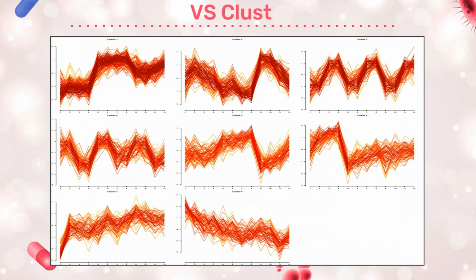So our next steps require looking at the heat maps for each of these cluster plots and seeing if it really reflects true significance that's also associated with changes in abundance. So those are the next plans for the project. And our goal is by looking at those heat maps, we'll be able to find, again, those lists of proteins, and hopefully we can do further analysis in the future.